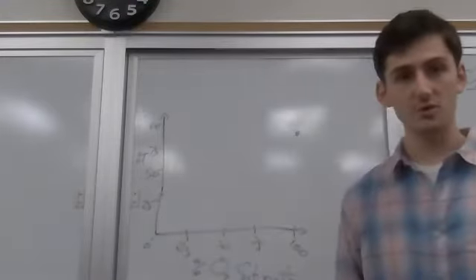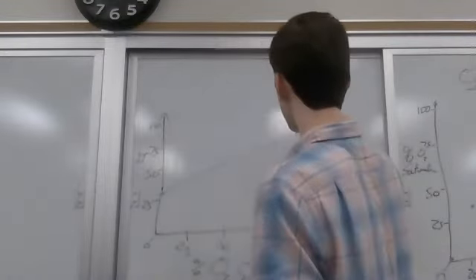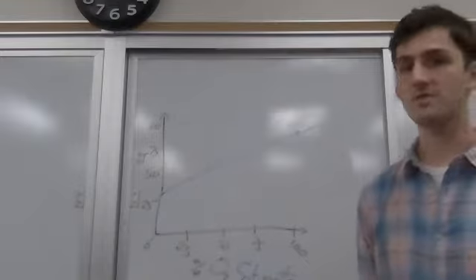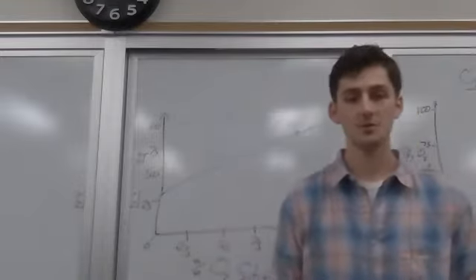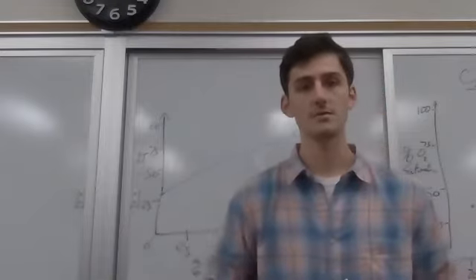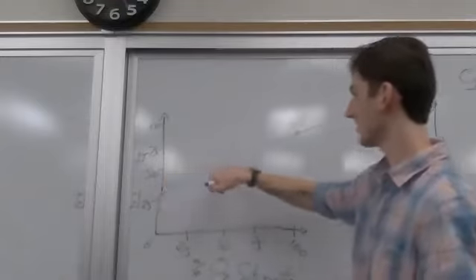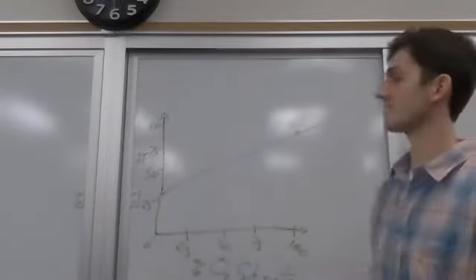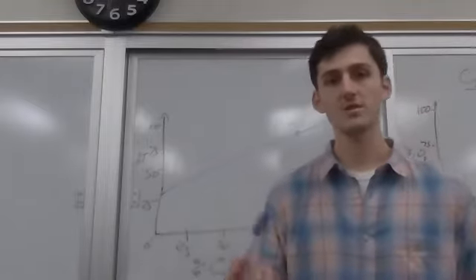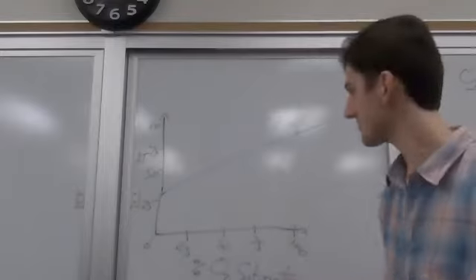So since we have two points, we can draw a line between the two of them, like that. And then we can start making inferences from the data. What we did is we took the transmittance values for every single one of our intervals that we were measuring, and plotted them along this line in order to determine the percent oxygen saturation that corresponds to that percent transmittance of that hemoglobin at a certain pressure.